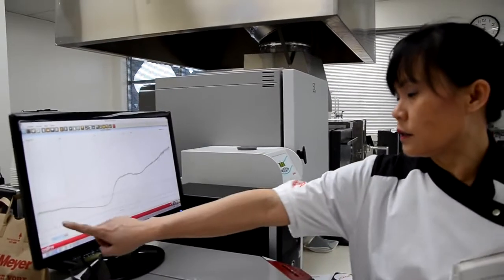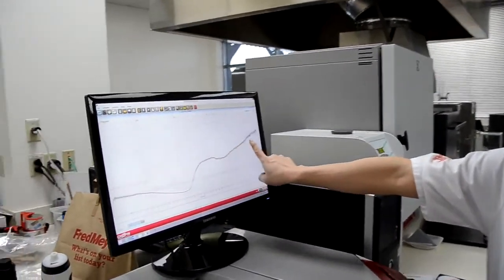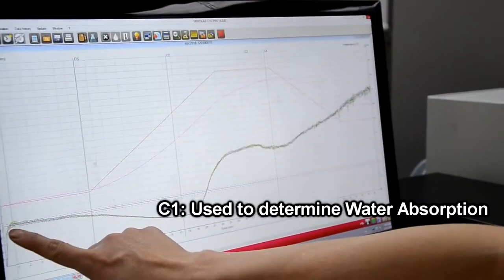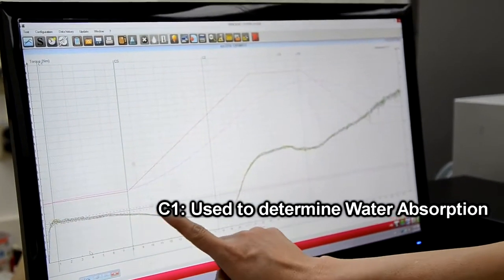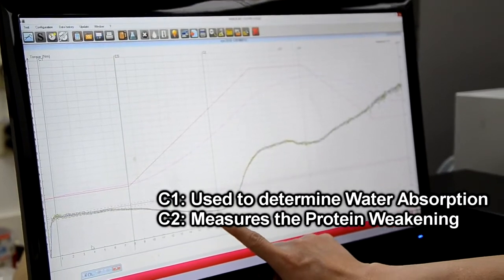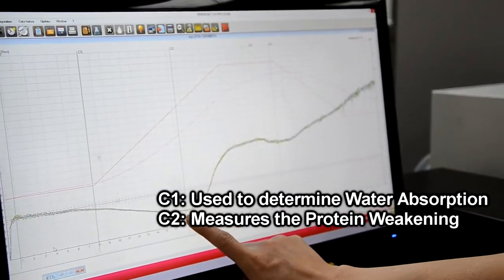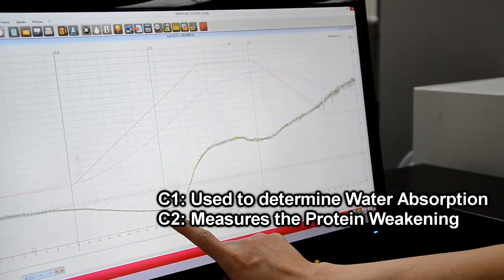Here you can see that the test results has ended. You have C1 here, which is used to determine water absorption. C2 here, which measures the protein weakening as a function of mechanical work and temperature.